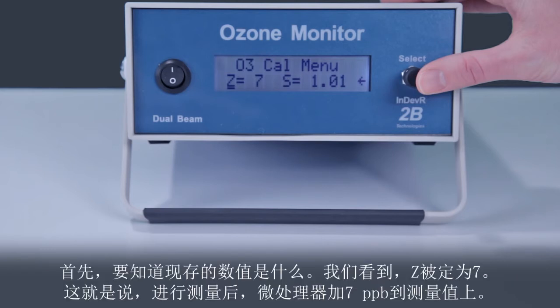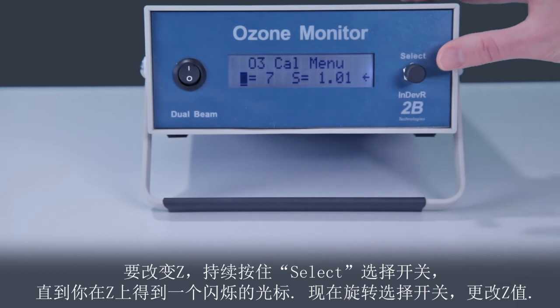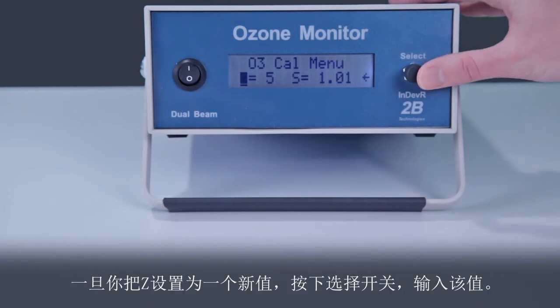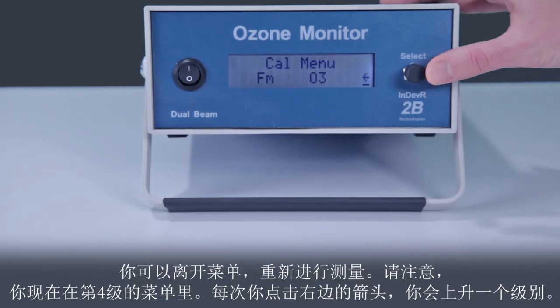You want to change the offset Z. First, note what the current value is. We see that Z is set to 7, meaning the microprocessor adds 7 ppb to the measured value. But you now know that the ozone monitor is outputting a value too high by 2 ppb. So you need to reduce Z to 5 ppb in order to make the ozone monitor read 2 ppb lower than before. To change Z, hold in the select switch until you get a blinking cursor over the Z. Now rotate the select switch to change the value of Z. Once you have Z set to the new value, press the select switch to enter that value. You can leave the menu to restart making measurements.